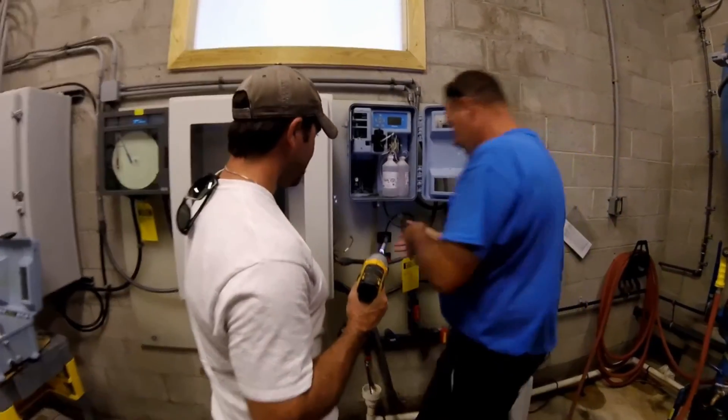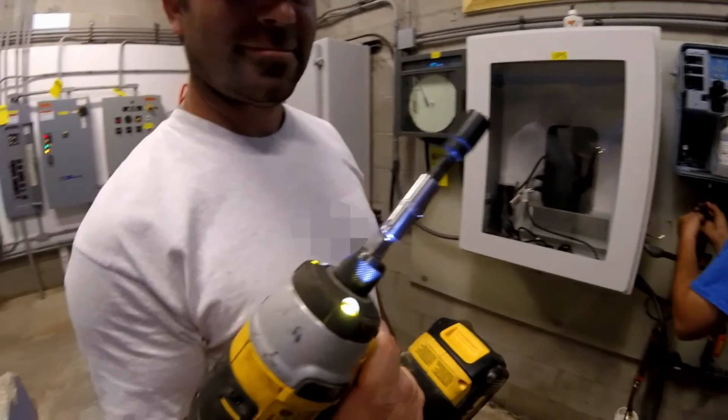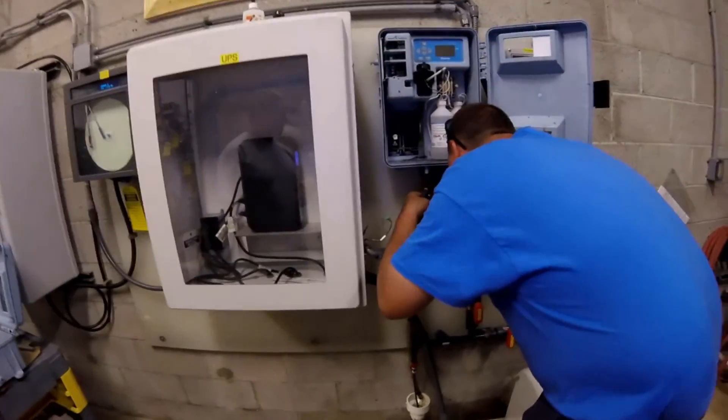John is back. He has a power tool. We are to use caution when using power tools — your shirt could get caught up. It's variable speed.